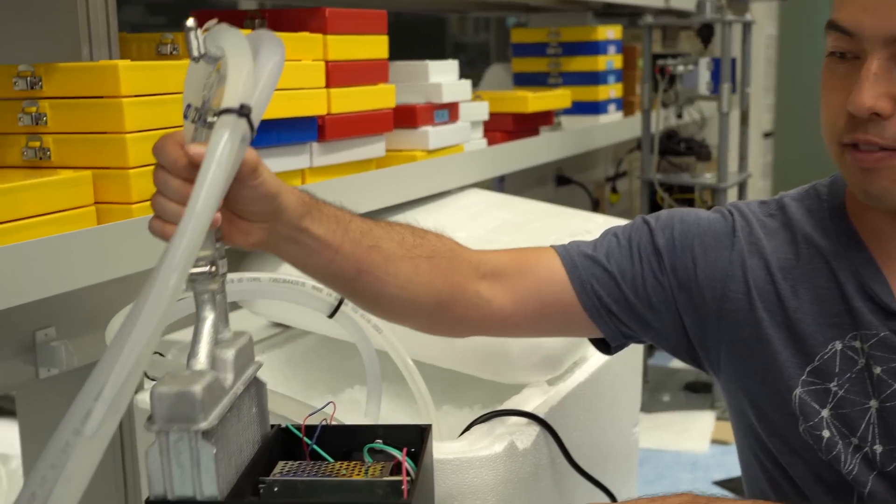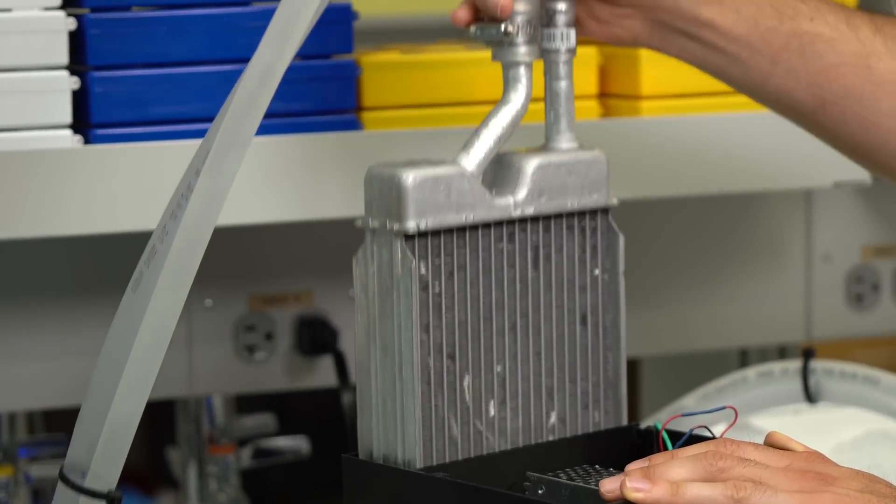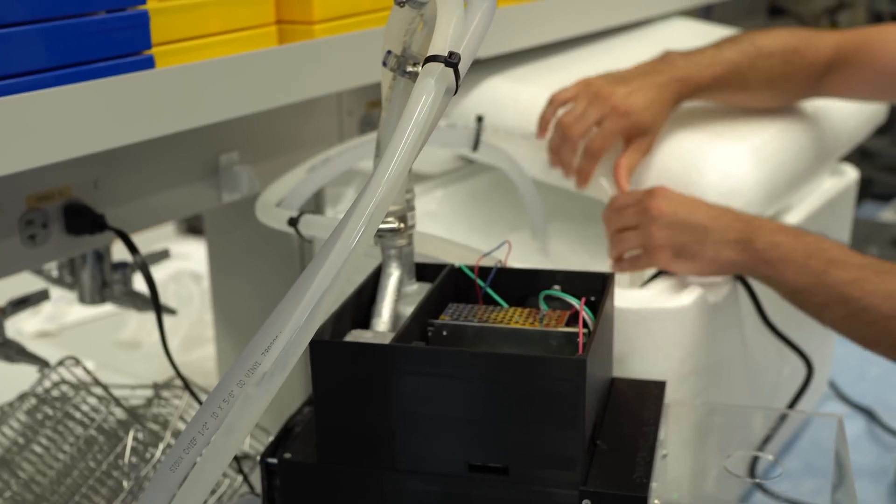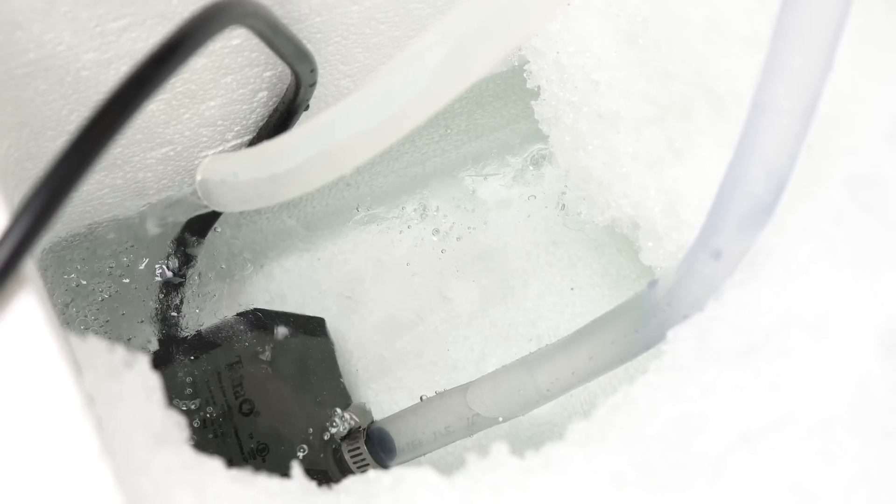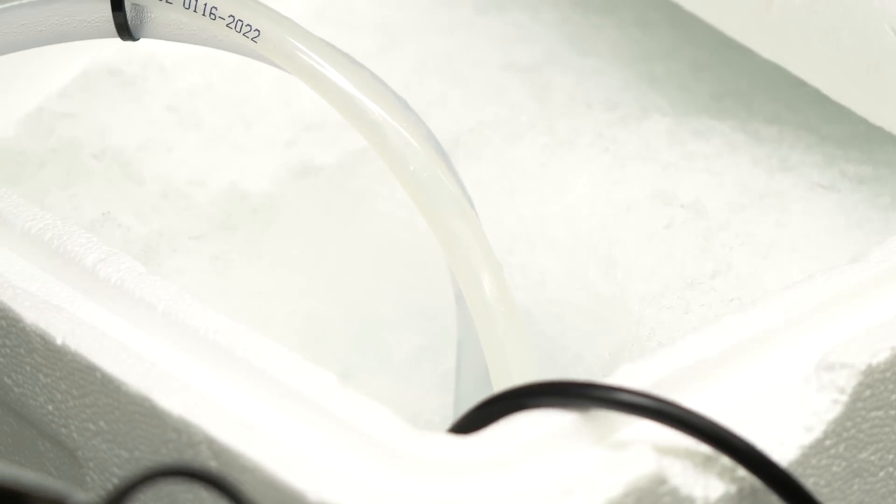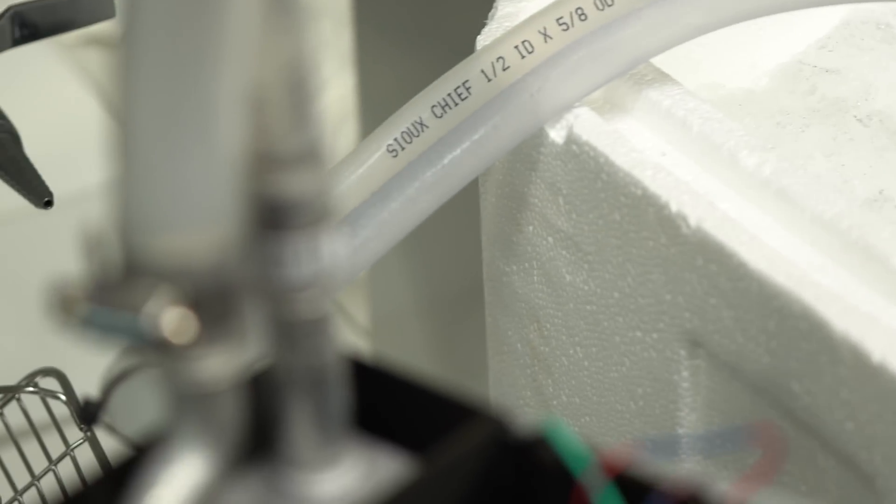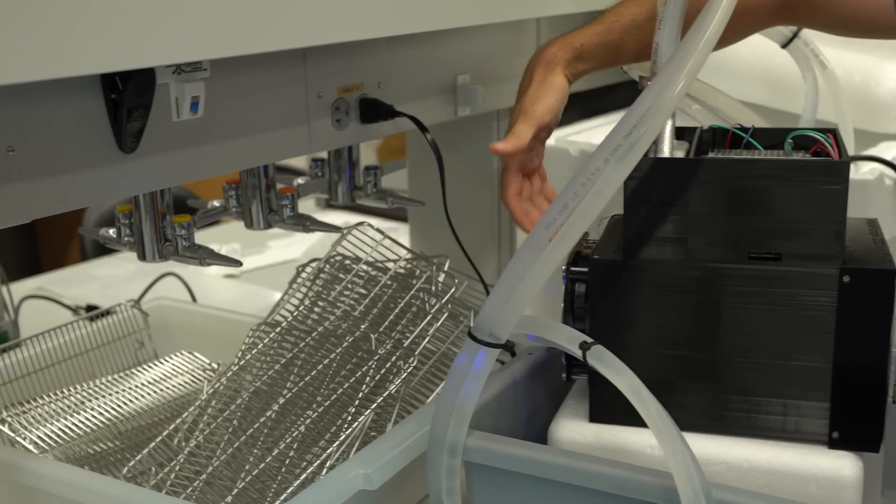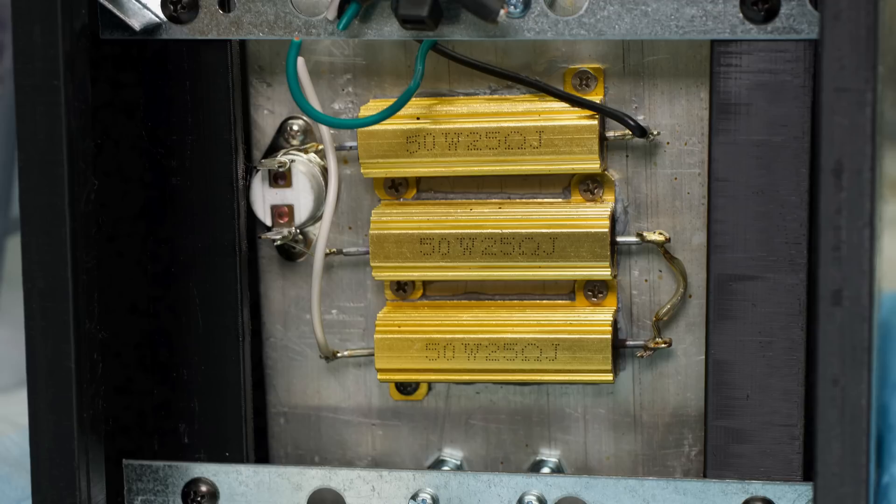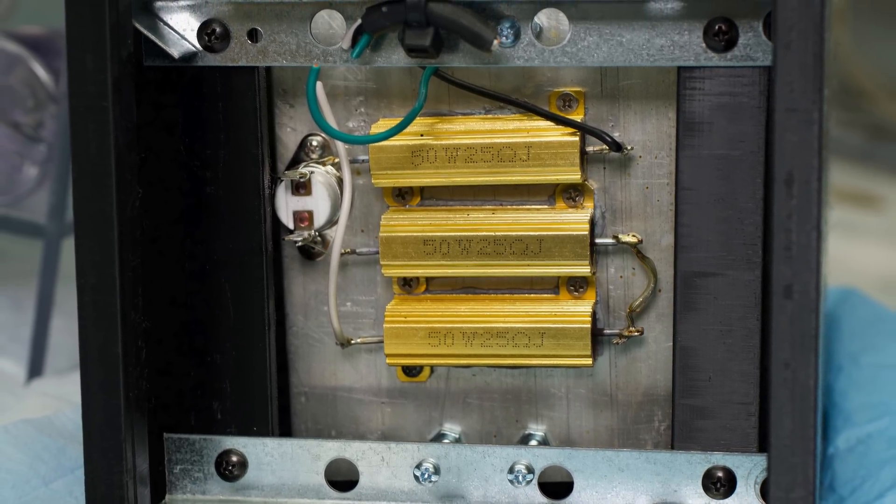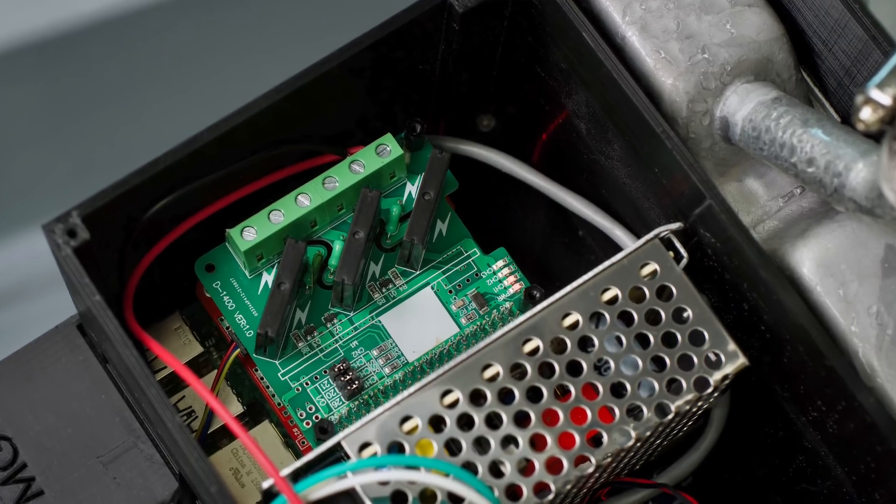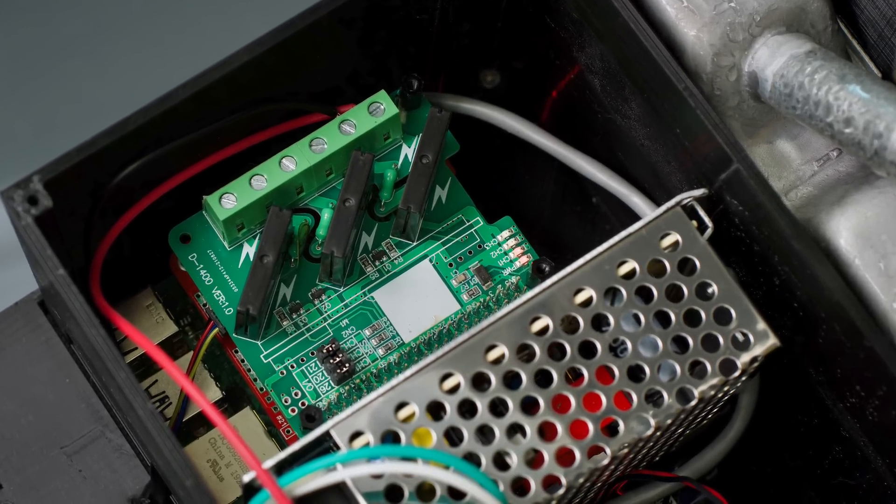To cool the air down, we have this radiator from a car, and I have it hooked up to a fountain pump and a bucket of ice. It takes this cold water and runs it through all this tubing and then through the radiator. And then this fan blows the cold air through the radiator and then past a couple of resistors in here, some nichrome wire. And I have control over that nichrome wire with the Raspberry Pi, which allows me to turn them on and turn them off at will. So the big advantage of this setup is that the mice don't know what's happening. The only thing that changes for them is the temperature of the air. It sounds the same when it's warm and when it's cold, there's not any extra stress going on.